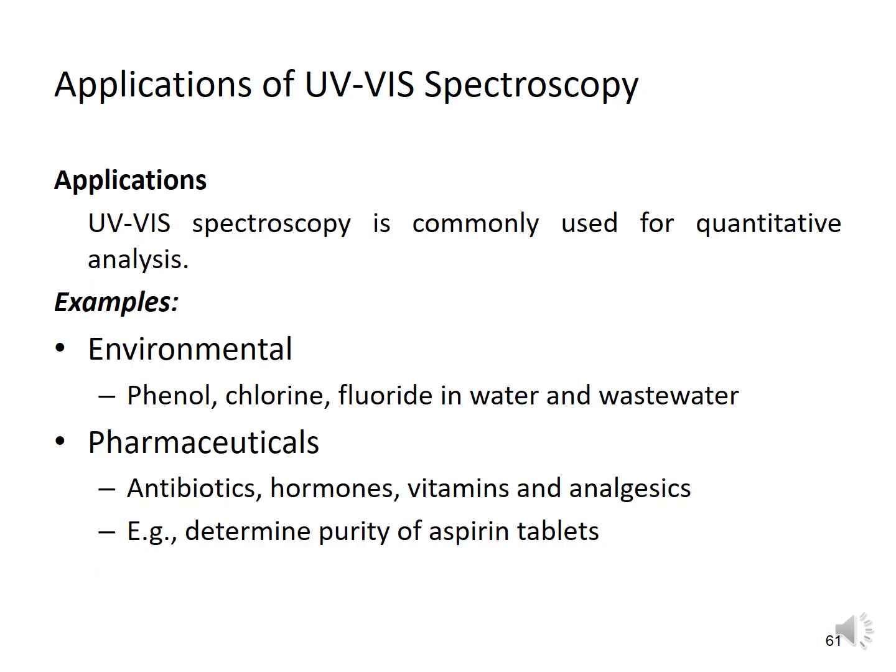So basically, what are the applications of UV spectroscopy? Especially in the environmental field, to detect phenol, chlorine, and fluoride in water and wastewater. For pharmaceuticals, we can use it for antibiotics, hormones, and to detect vitamins and analgesics.